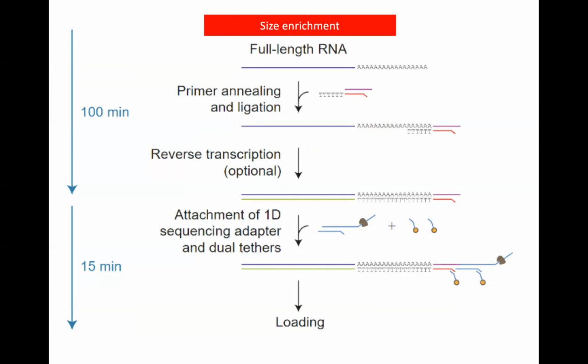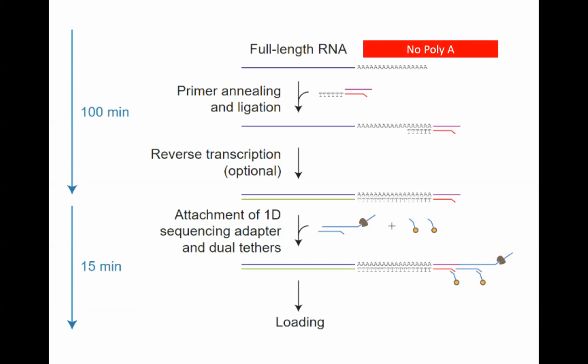And tRNAs are known to be very highly modified, so there could be interest for many researchers to identify potential modifications on those RNAs. Another limiting factor, as I mentioned before, is the absence of a poly-A tail. And this absence is actually the most significant limiting factor in this protocol because many, for example, snoRNAs, snRNAs, or tRNAs lack this poly-A tail, although we have to mention here that when many of them are marked for degradation, they may get one.